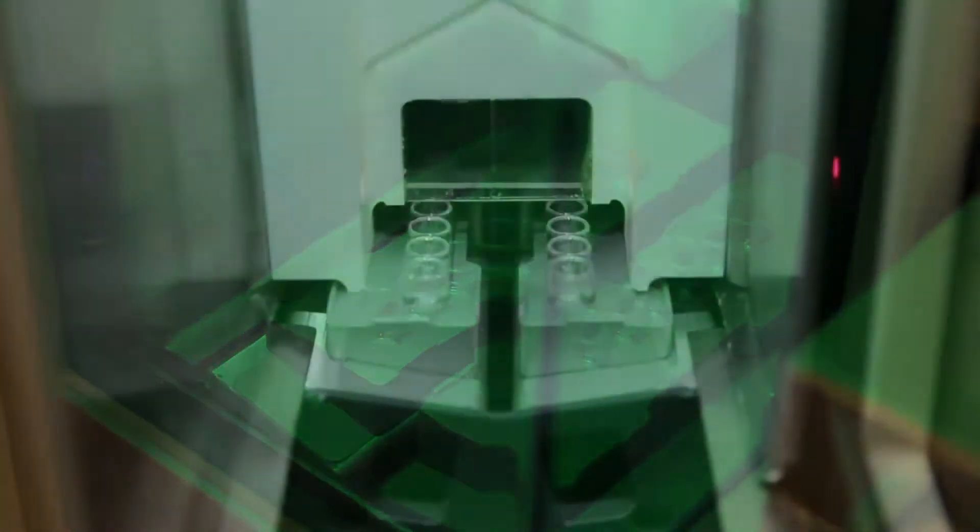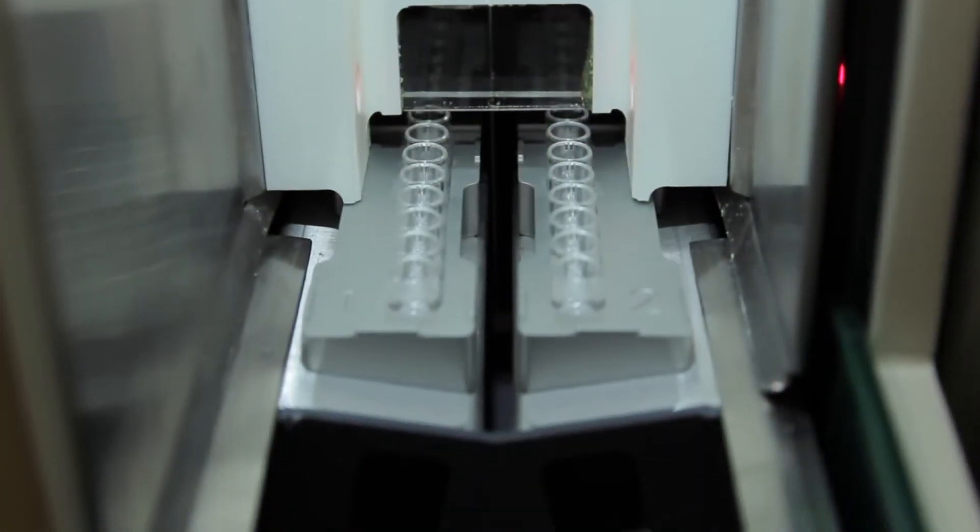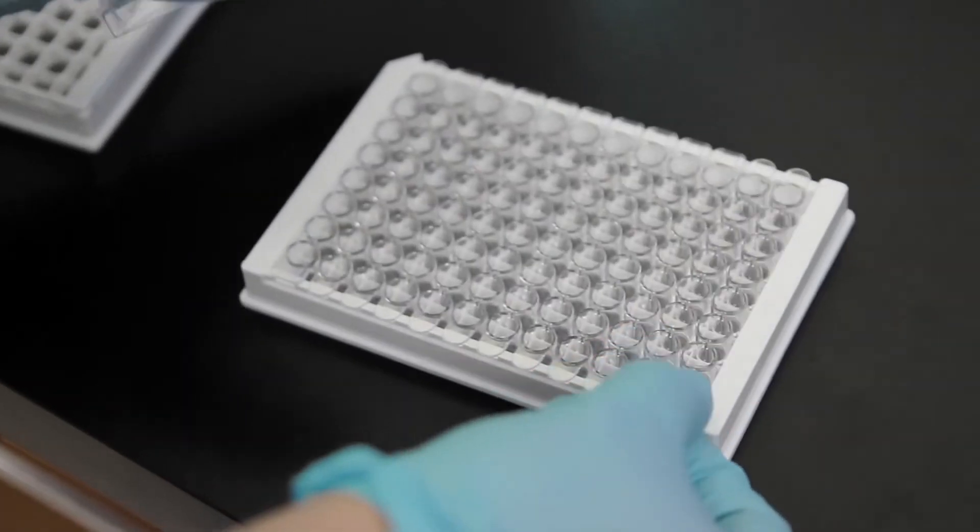Demands on your time can feel daunting, but the S3E streamlines your research, so you get your time back. Before, when I was having to go to NYU all the time, that would be like one experiment a week. And so that was really slow progress.